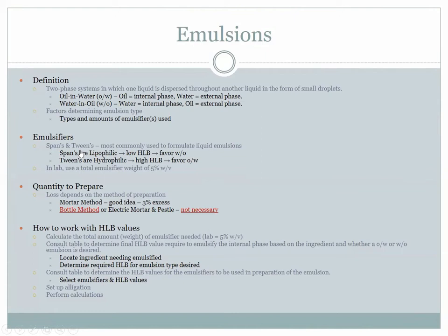So if you look on your dry lab prescription, we're going to take this mineral oil from Mark and essentially make it yummy, because we're going to mix it with cherry syrup, because who doesn't love cherry syrup? However, the problem is mineral oil is an oil and cherry syrup is a water-based flavored vehicle, and they don't mix, right? Water and oil don't mix. Or do they? You as a pharmacist can say, oh, I can mix those for you. All we need to do is add an emulsifier, because an emulsifier is a chemical structure that has a hydrophilic head and a hydrophobic, or lipophilic, tail, so that it orients and can hold part of the water next to the oil and hold it together, and essentially make it mix. I didn't do a great job with that, I'm sorry.